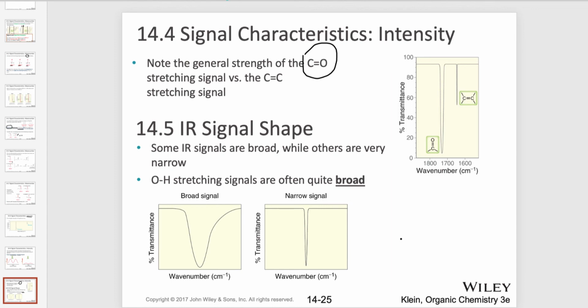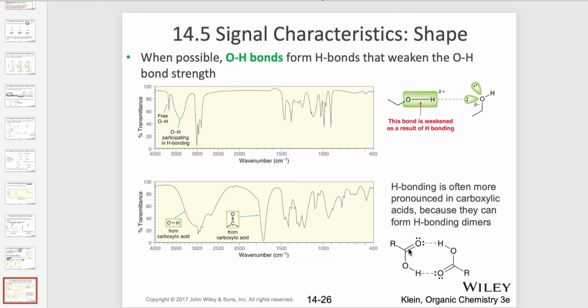We also want to understand that some of them can have a narrow signal, while others can have a broad signal. And a broad signal is very indicative of the hydroxyl group, an OH group, right? So you have an OH group in an alcohol or in a carboxylic acid. So we need to pair up all these bonds with the functional groups, and then we look for that in the spectrum. Here are two examples, and I've also incorporated a couple of spectra in your handout.